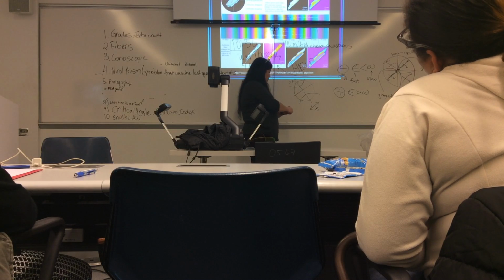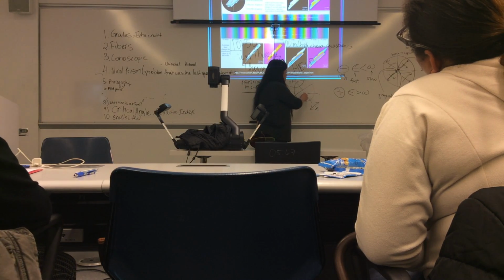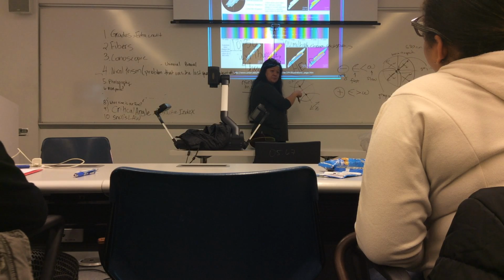And the isogyres, you have the emergence points of the optic axes right at the center of the brushes.